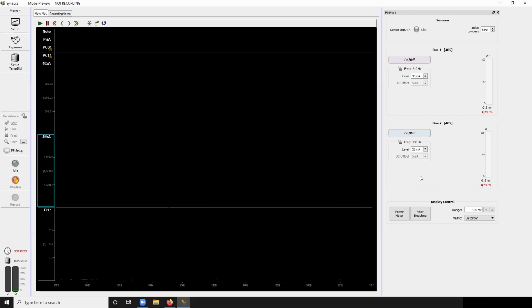So if you were to use that FC cable that you used earlier, where I said to go from the sample port to the PM1, for people who have a rotary joint, you'd want to go from the output of your rotary joint to the PM1, because rotary joints can have associated loss of signal and light power through them. Okay, so now we're hooked up from the sample port to the regular subject cable. So I'll turn these back on.